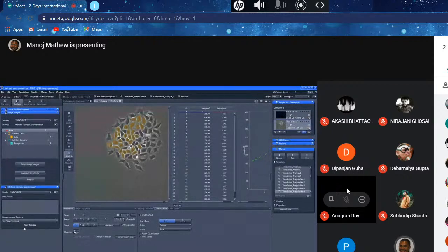So you can keep adapting your machine learning algorithm to new and new images that you acquire. Of course, if you are going to a completely different data set from HeLa cells, maybe fibroblasts or something, maybe you have to create a new trained model. But otherwise, if you keep on acquiring similar kind of data, you can keep refining it.